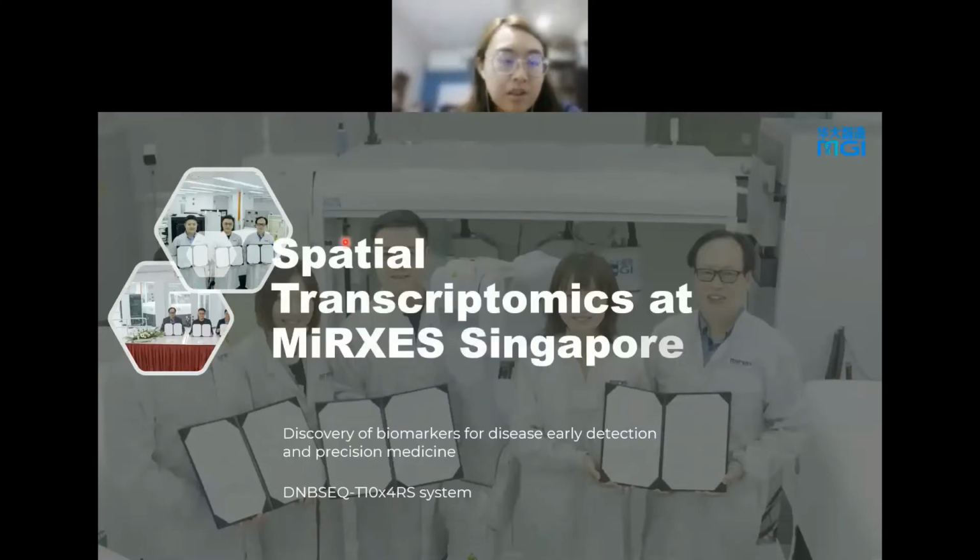So other than that, RNA-seq can also be applied in spatial transcriptomics. I think this has been the talk of the town for a number of years recently. So basically, spatial transcriptomics is like drawing a map of the biological interactions or molecular mechanisms that are happening in a particular biological system.